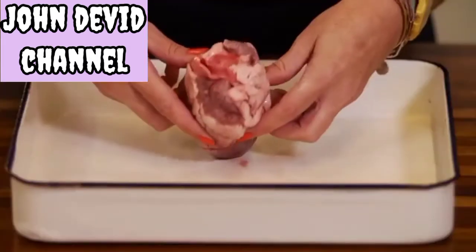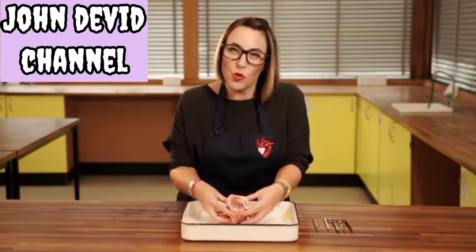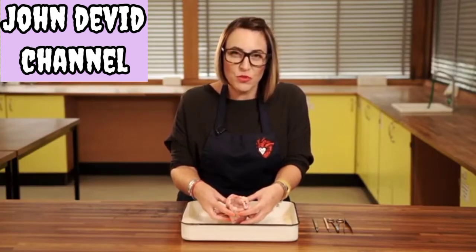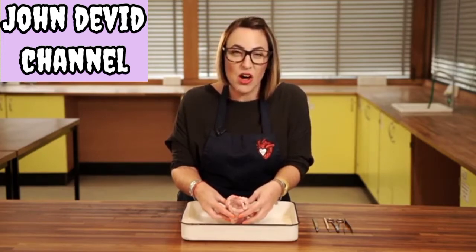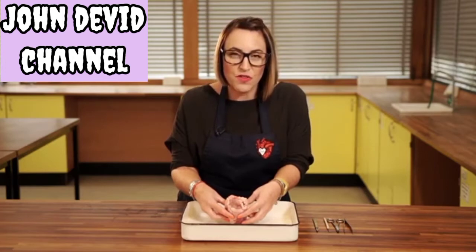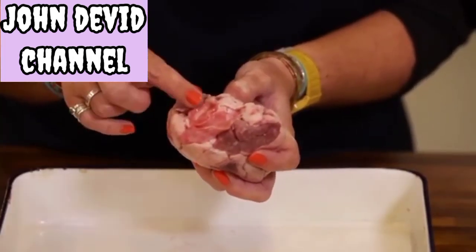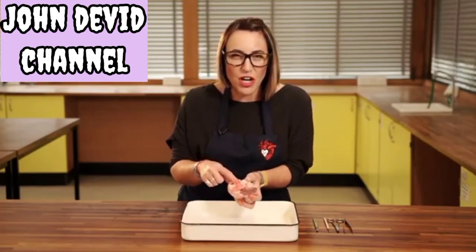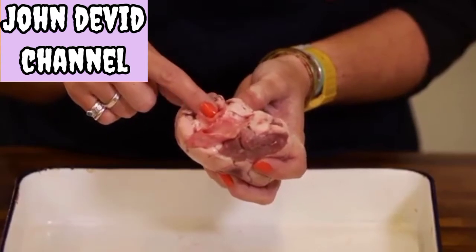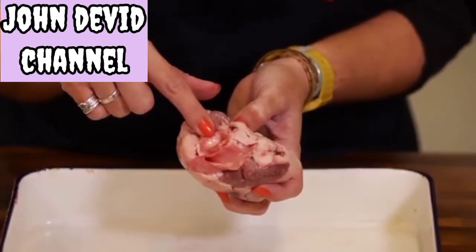You'll also notice a number of blood vessels on the top of the heart. Think of the heart as being like a four-bedroomed house — there's four rooms inside, and there's also four ins and outs, which is what our blood vessels do for us. They let the blood go into the heart or out of the heart through one of these four tubes. The first vessel to identify is the aorta — this is the easiest one to spot first because it's got the chunkiest diameter.